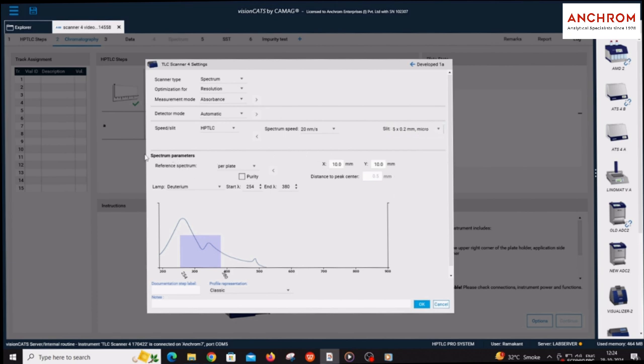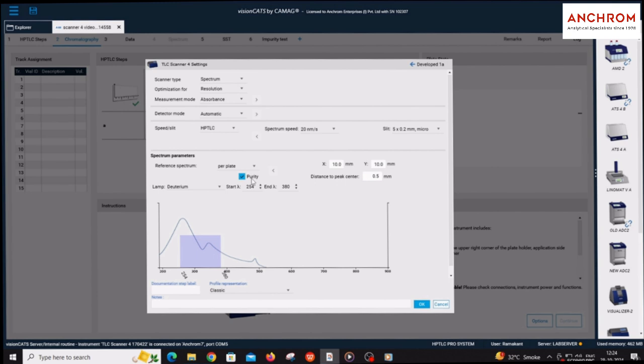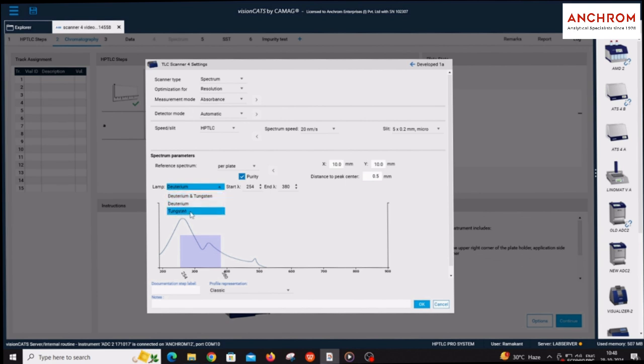Under spectrum parameter, reference spectrum should be kept per plate. Select the purity option to take purity of the spectrum at the start and end at the center of the separated peaks or bands. Selection of lamps depends on the activity of the compounds under UV light, visible light, and fluorescence light.